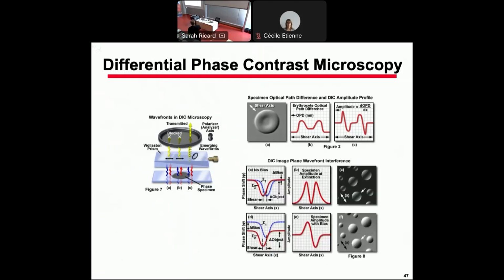Just like that. If, again, your setup is very carefully aligned. Because, of course, this quantity, so-called bias and lateral shear, you see, these are the images from the same sample, simply changing the distance between two rays and the phase change tolerated with the result. So when it's like that, it works.